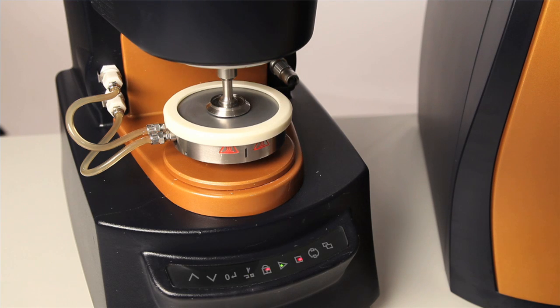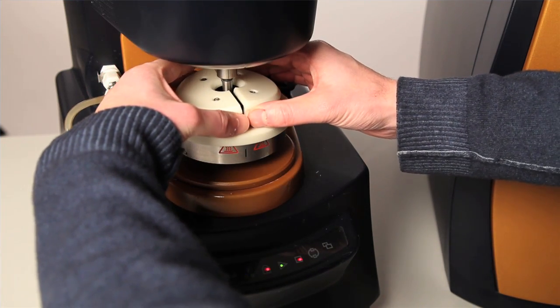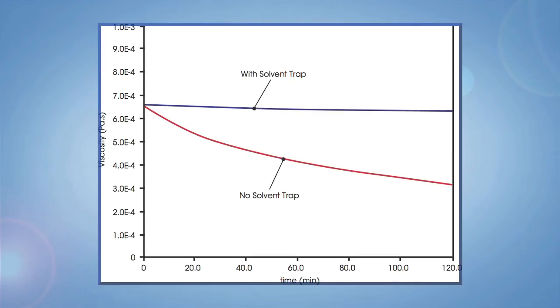The difference between using and not using the solvent trap can be significant, especially on long experiments. The drift of water viscosity over time is due to the reduced amount of water actually closed between the geometry and the Peltier plate.